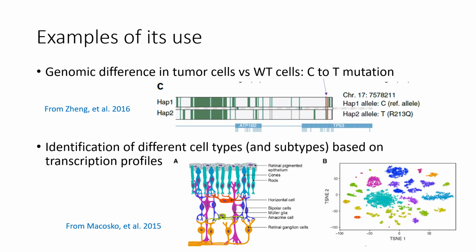The plot shows a two-dimensional representation of gene expression among all the cells. They've reduced 32 statistically significant principal components into 2 dimensions with a dimensionality reduction technique. You can study expression of up to a few dozen genes at a time with flow cytometry and come up with something similar to the B panel on your right. However, with single-cell sequencing, you can look at differences among as many genes as you want at a time.